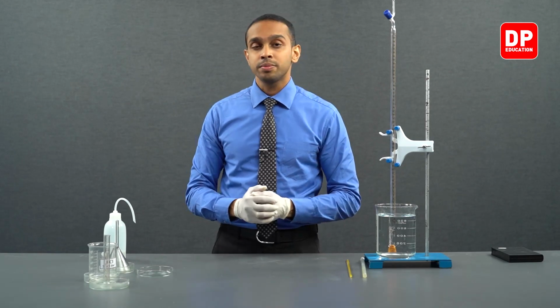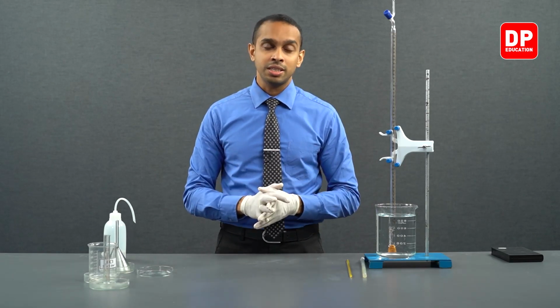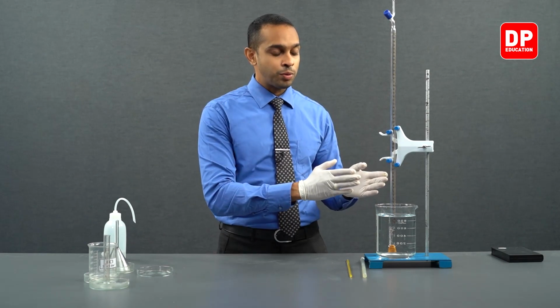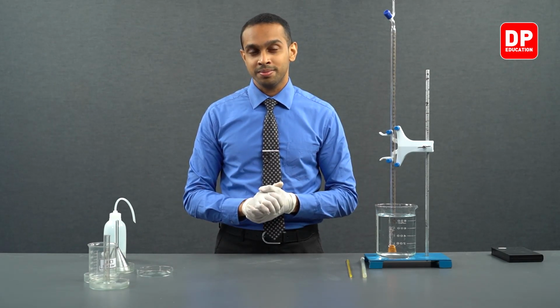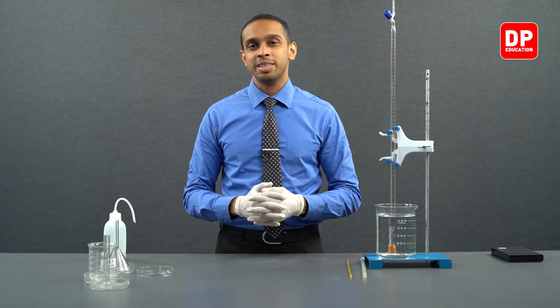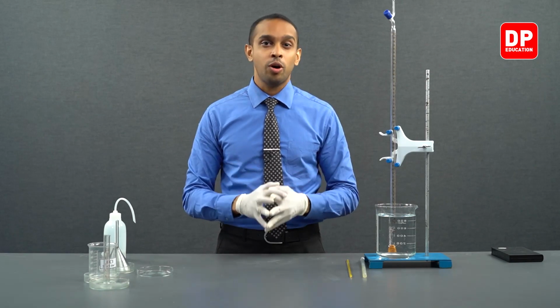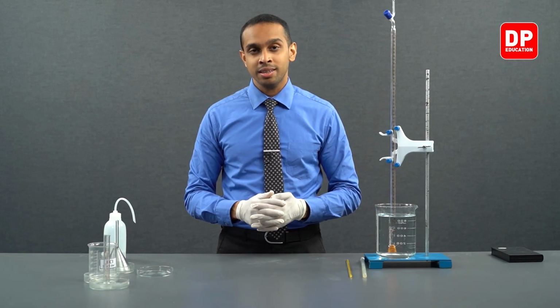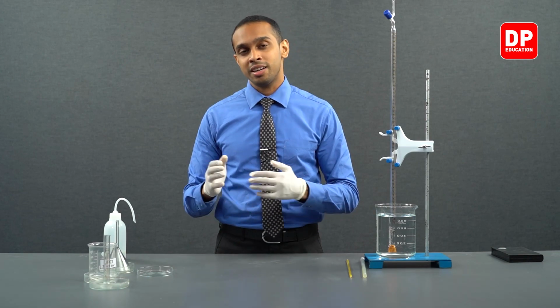The temperature of this water was 23 degrees Celsius, and the gas that was collected was at 1 atm pressure. With this information at hand, we will move on to the calculations revolving around this experiment and other theory parts that are important to this practical in our next session.